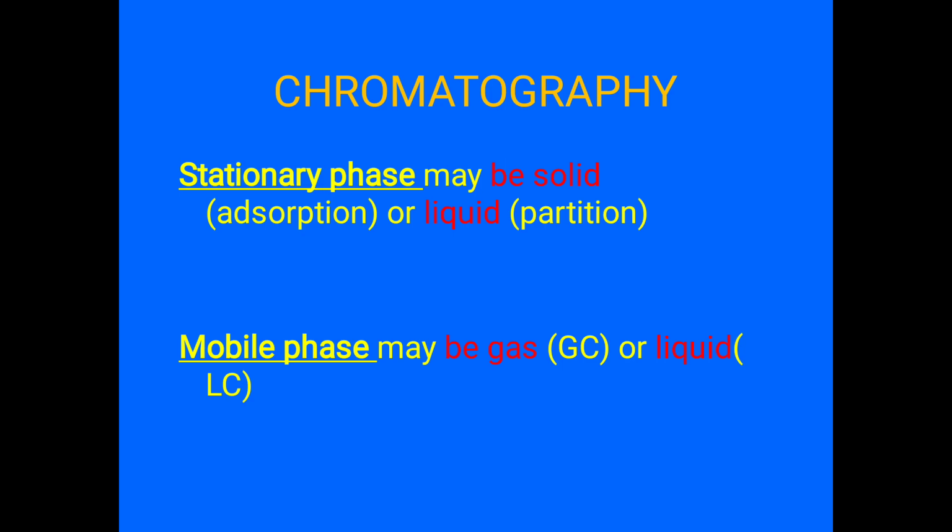Chromatography. Stationary phase may be solid adsorbent or liquid partitions. Mobile phase may be gas or liquid.